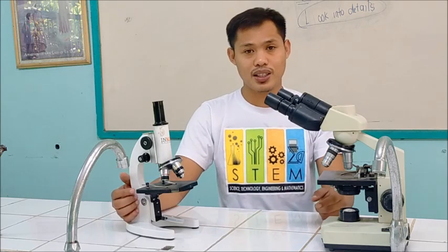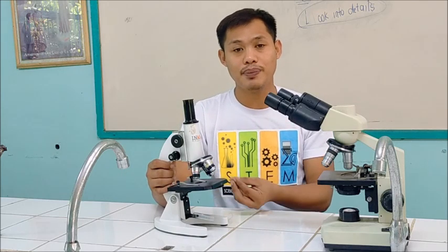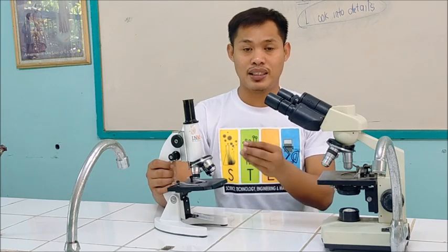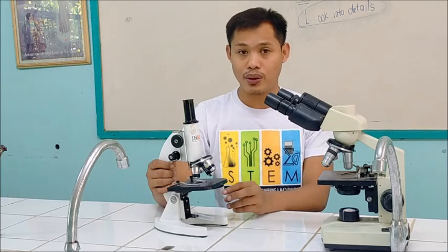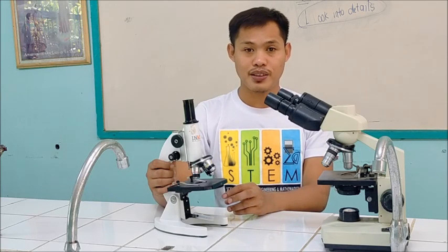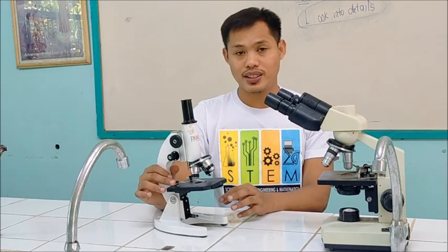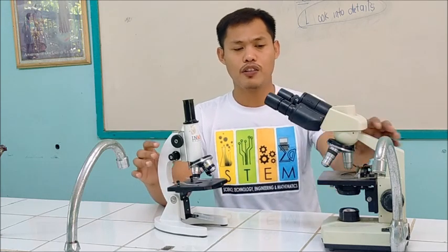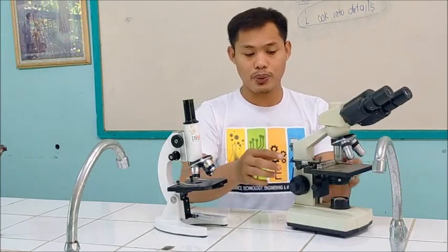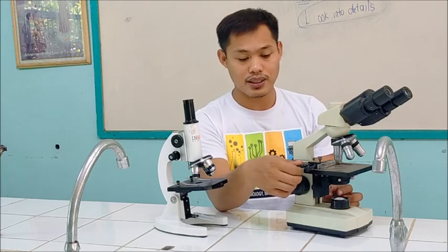The next part is the stage. Looking at the stage itself, the stage actually has a hole at the center. What is the purpose of the hole? The hole is the passage of the light that comes from the light source, which is regulated by the diaphragm. On the stage we have the stage clip, which holds the specimen in its position. For the binocular microscope here, we have the stage adjustment knob, with which you can adjust the stage clip.